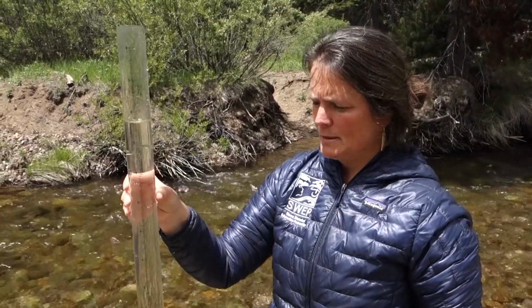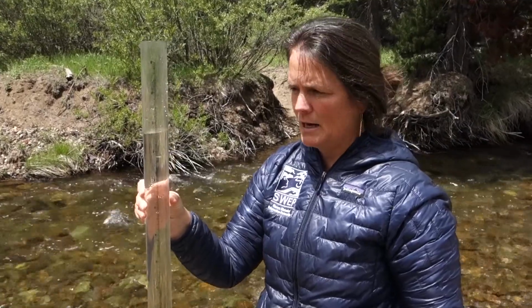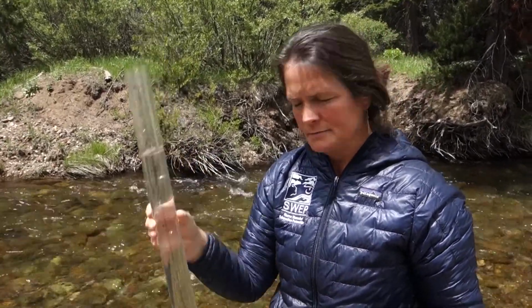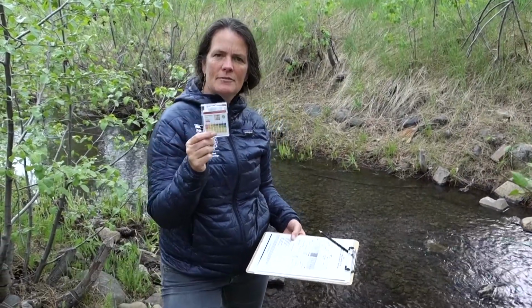So for our turbidity test, our water comes back with a pretty clear rating, which is good. A more sophisticated turbidity test would probably show a higher particulate matter than we are able to identify with this turbidity tube. But this is just one way of collecting turbidity data. So next we're going to be measuring the pH, or the acidity of the creek.